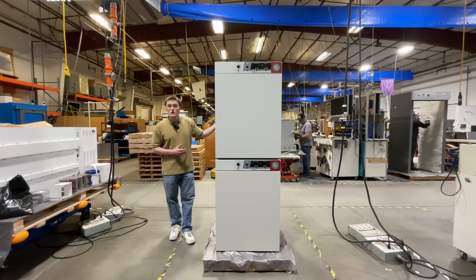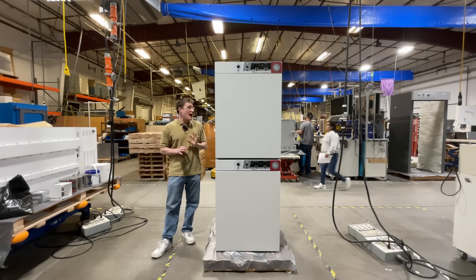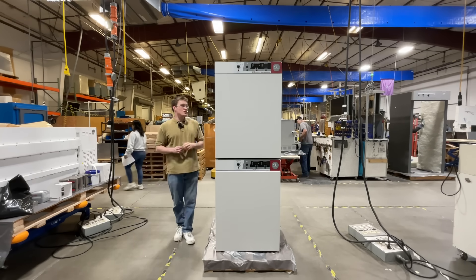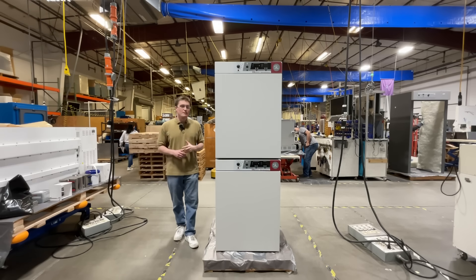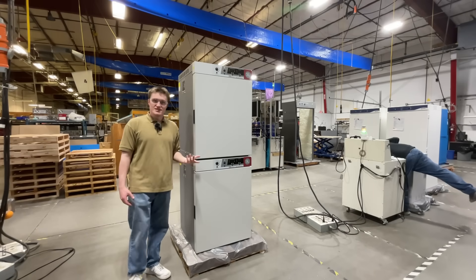This unit is equipped with advanced HEPA filtration, providing ISO class 5 air quality within the chamber. It ensures a clean, contaminant-free environment for sensitive cell cultures. Now let's take a look inside the unit.